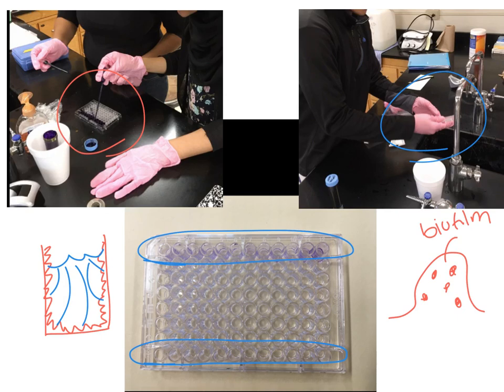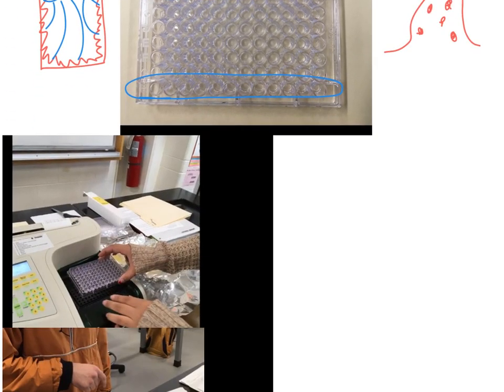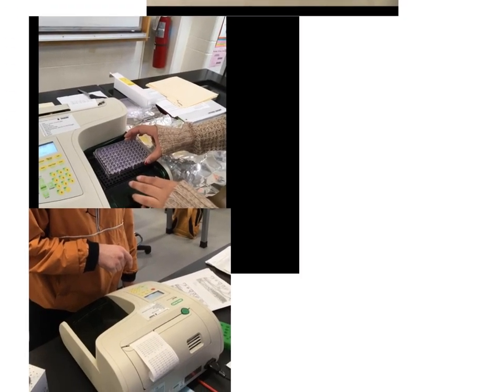We can quantify that data, so rather than just using my own opinion of, oh, this one looks more purple and this one looks less purple, we use a machine called a plate reader to quantify that growth, meaning to get numerical numbered data telling us how purple is that well.